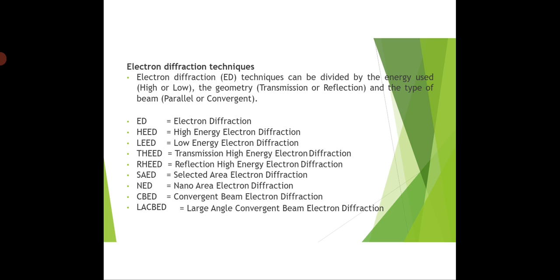SAED, selected area electron diffraction. NED, nano area electron diffraction. CBED, convergent beam electron diffraction. LACBED, large angle convergent beam electron diffraction.